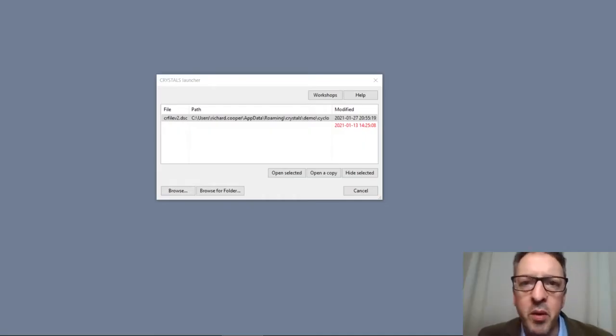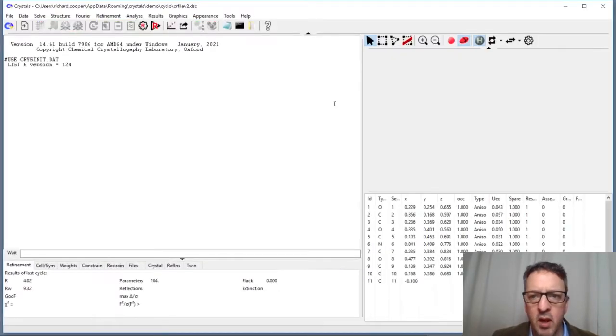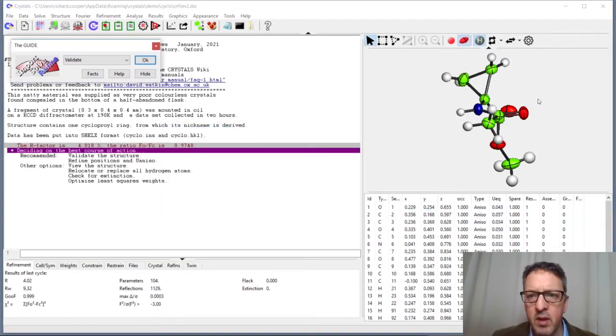Hello, this is a very quick video to try and show you how to use CheckCIF from Crystals. You can see the Crystals launcher here on the screen, and it contains just one entry, which is the last structure I refined. Double click that to open it, and there it is.